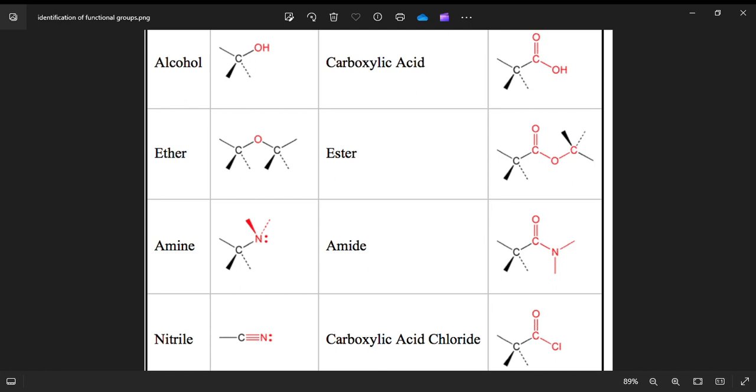So with that, phenol is confirmed. But with carboxylic acid, it will dissolve in NaHCO3, plus ethanol plus H2SO4. Once you notice effervescence and a sweet fruity smell of an ester, that confirms carboxylic acid.